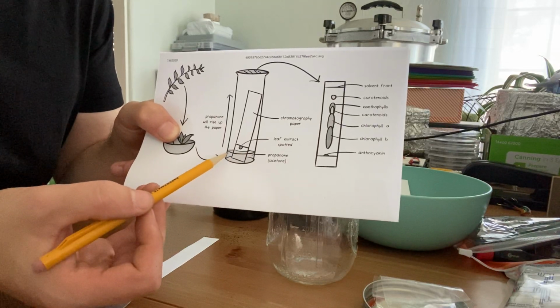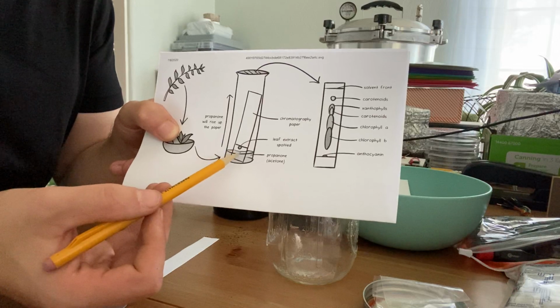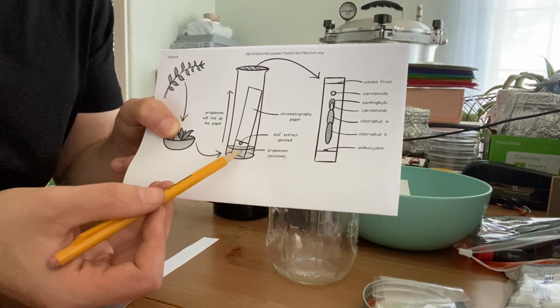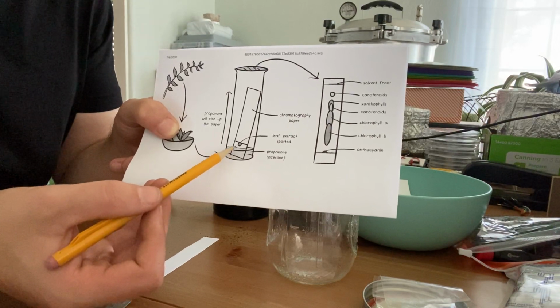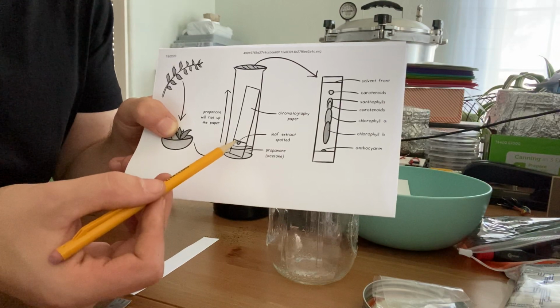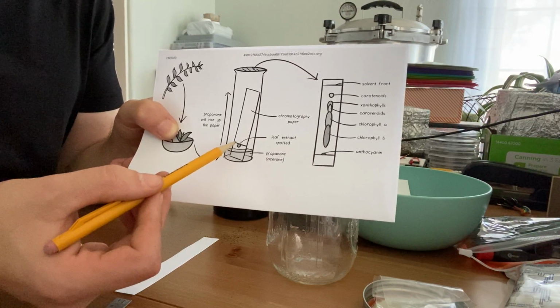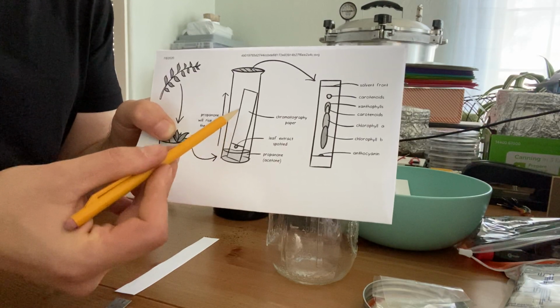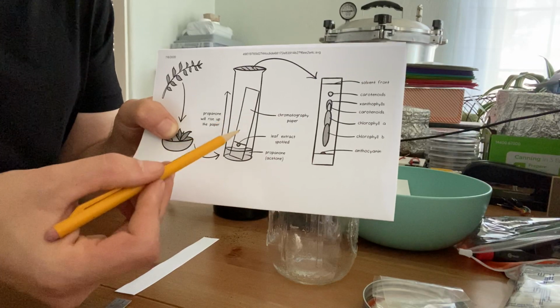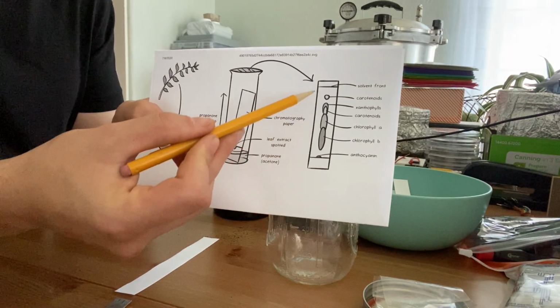And note that my solvent, the mobile phase, of TLC is going to actually be in the jar just below that. You basically want the solvent to be soaked up by the paper due to the capillary effect and to reach the extract. And then as it hits this extract here and begins to climb up, the different compounds within here are going to separate. And as they separate, they're going to create different colored marks on the paper.